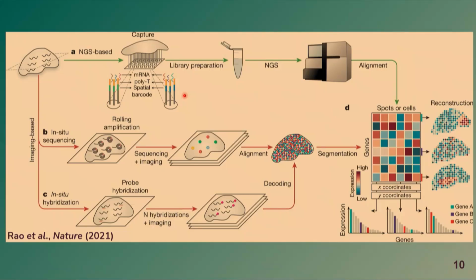That's why we have not only the sequence information, but also the XY coordinate information. And this XY coordinate information is also encoded in a sequence tag associated with this probe. So all of this is condensed in a tube that is taken to a machine called a sequencing machine, to transform the strand of DNA into letters into computing. This methodology is called NGS-based.